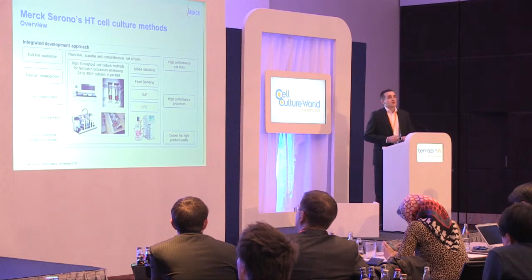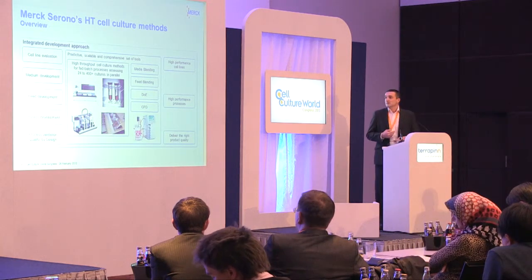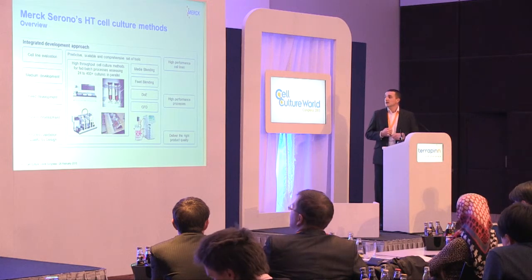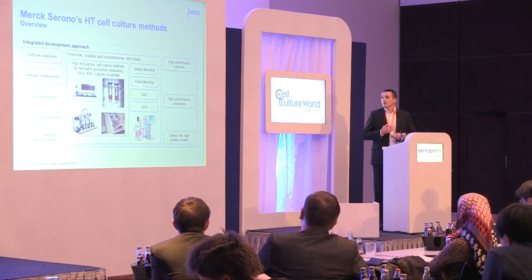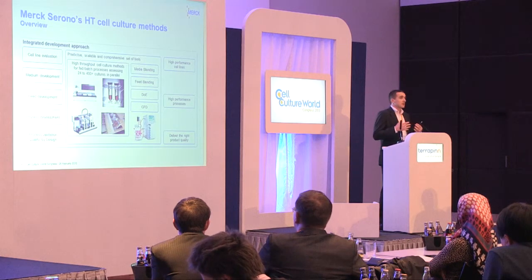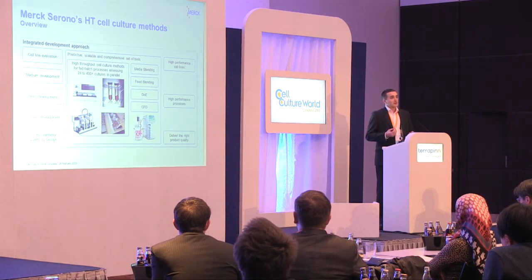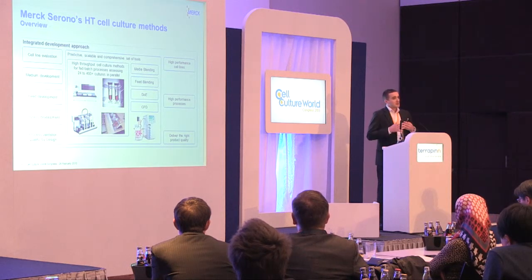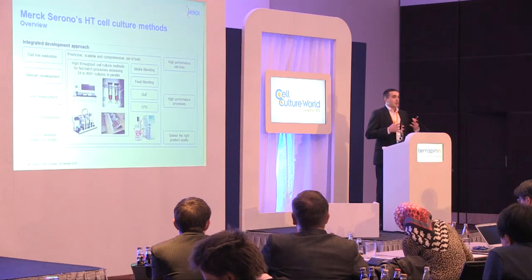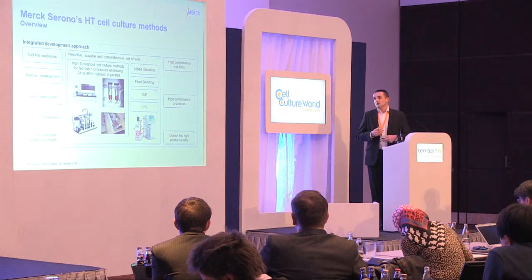On top of that, during the last year, we have really improved the way we develop our processes with improved design of experiment using media blending, feed blending, DOE, but we also try to make the smaller scale, like 96 deepwell plates, predictive of the manufacturing performance. So we are implementing also computational fluid dynamics to really fully understand what is going on from the really small scale to the manufacturing.